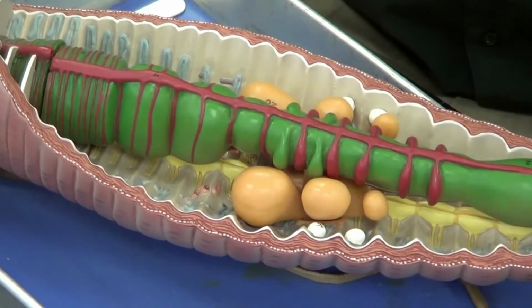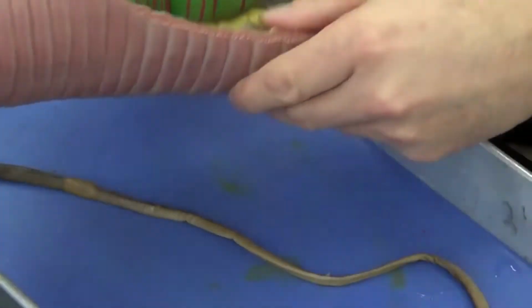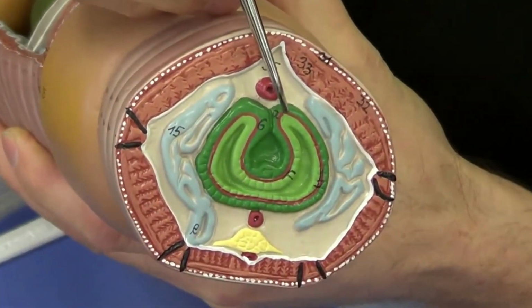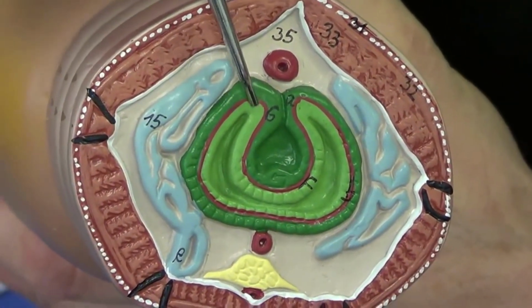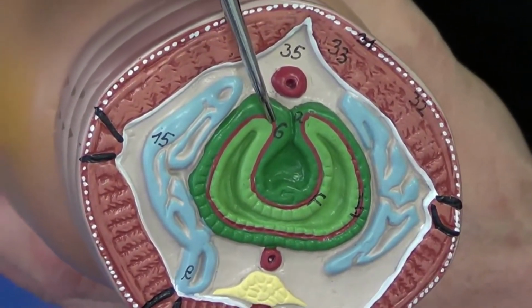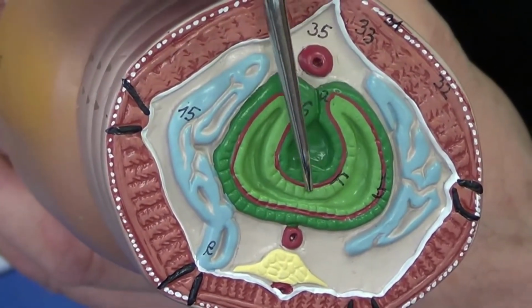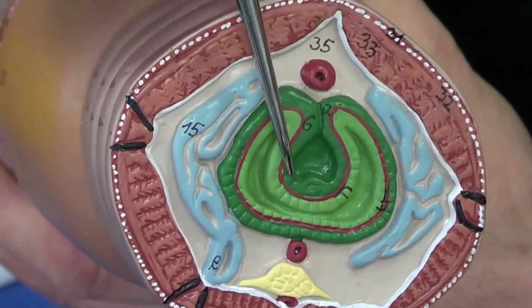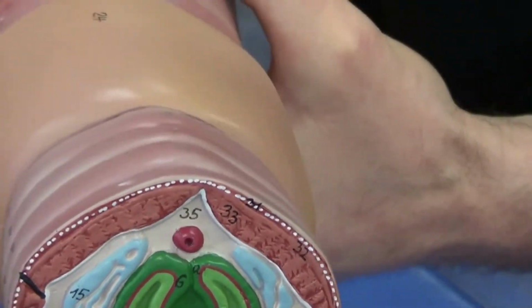And we're going to do that in two ways. One, we're going to have a very long intestine. And number two, if we look at a cross section of the intestine, you'll see that right here we have an infolding of the intestine, and it forms a loop. And this loop is going to greatly increase the surface area in the intestine. You can see that if the tissue just came straight across, we would lose all that additional surface area for absorption. So this structure has a name. It's called the typhlosole, and its job is to increase the surface area for absorption.